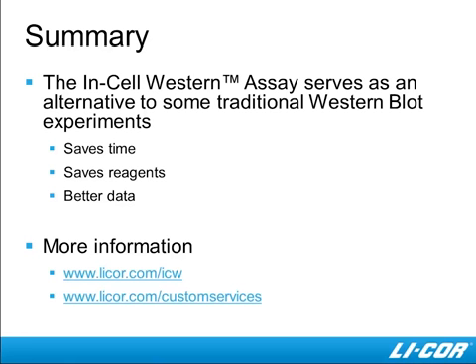That's a really good question. If your primary antibody recognizes a lot of nonspecific bands on a Western blot, so let's say it recognizes your band of interest, but also 10 other bands. If you transition that experiment into an In-Cell Western, that means the signal you read on an Odyssey, a fraction of it will be your target of interest, but a majority of that signal you read in the well will be nonspecific. So it will decrease your sensitivity and decrease your ability to detect changes in your target of interest, whether it be phosphorylation or protein abundance.